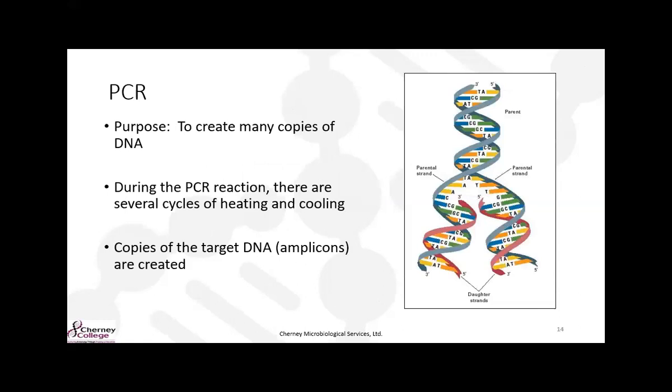So let's switch gears and talk a little bit about PCR detection. PCR is a naturally occurring reaction used for amplifying DNA. This takes place in your cells when your cells are replicating. So we go from one parent strand of DNA, and it's then split into two strands, and those daughter strands are made by matching base pairs.